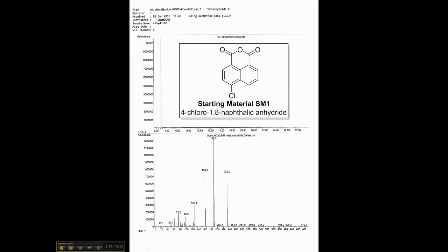So in this particular molecule, once you add up what it all should add up to, you get two different numbers: 232.0 for the chlorine 35 isotope and 234.0 for the chlorine 37 isotope. This information about the isotopes of chlorine shows up in the background information that I gave you in the lab packet. So if you're not making sense of this, try reading the background information in the lab packet.